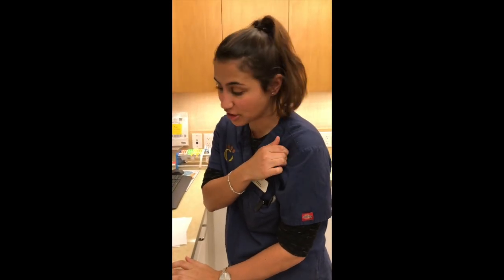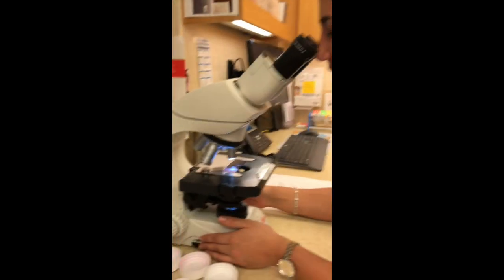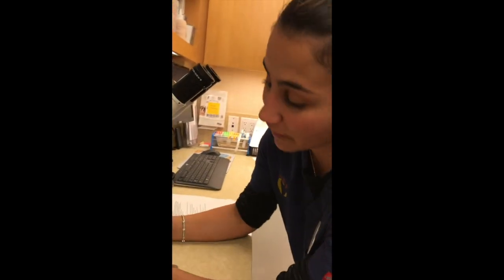Now we'll let it dry just for a few minutes and then we'll take a look under the microscope. Okay, so now we're going to take a look at our ear cytology. I'm first starting off at only 4. First I'm just going to move this slide so I get a good view of exactly what I'm seeing. I'm just using the fine knob right here just to make it a little clearer.